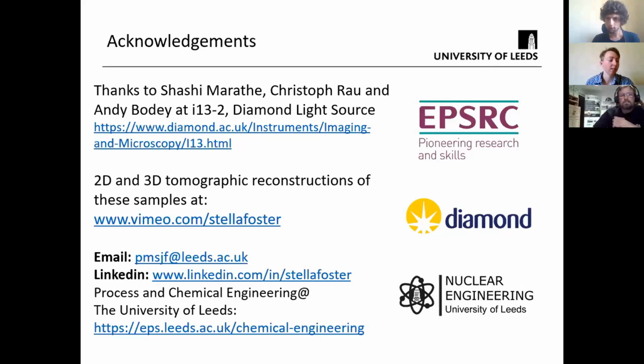So I would say last question. Well, okay, let's take two last questions here. What might be the reason behind the decline in porosity volume on zinc chloride activation compared with unactivated ones? I think that's referring to the macropore volume, I should say. I obviously didn't do a great job of explaining this, or perhaps I rushed it a bit, but let me go back.